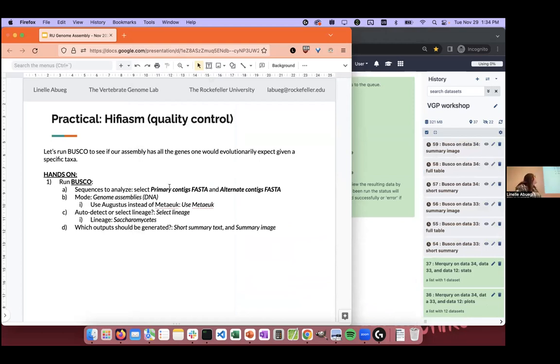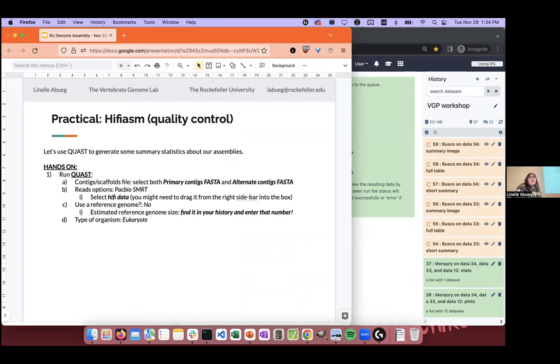For our pipeline, we usually just have this set to vertebrata, but if you want to be more specific, they have a lot of other data sets for like ray fin fish, aves, stuff like that. Okay. I think that's good for now. The last QC we have to do is just summary statistics, so getting stuff like the N50, average contig size.